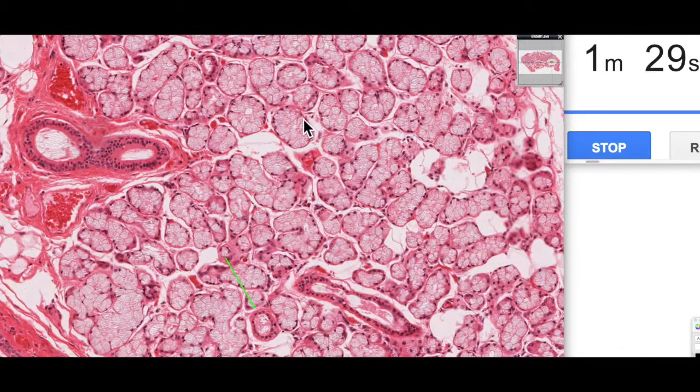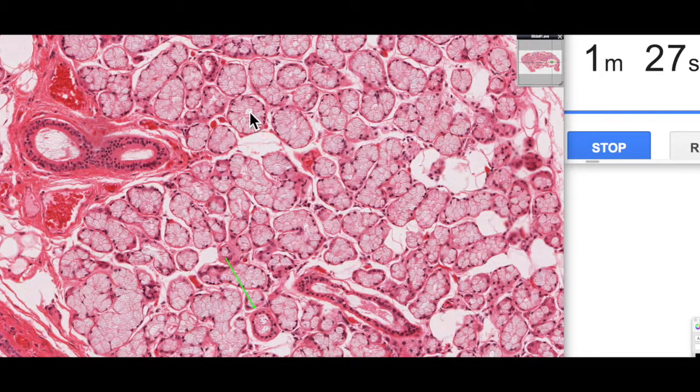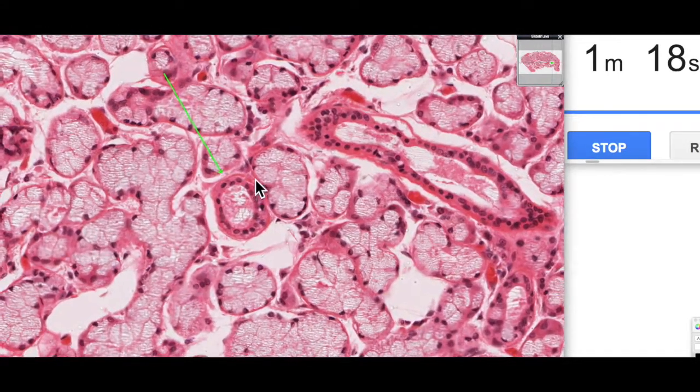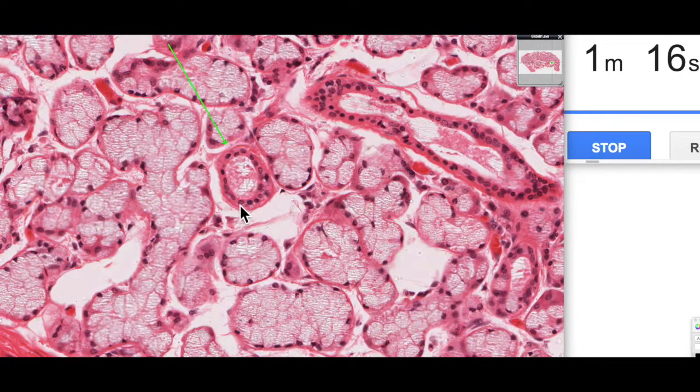Let's zoom in here. Here's our mucus acinus. You can see the lumen of the beginning of the ducts being drained into there. Eventually it gets collected into these other intralobular ducts, so within the lobule. Here we've got one of those ducts. You can see the round nuclei again with a single row, so it's simple. Round nuclei indicate a cuboidal type of epithelium.